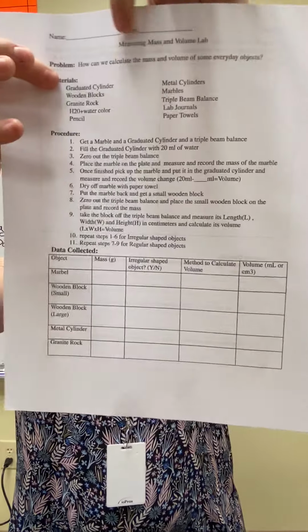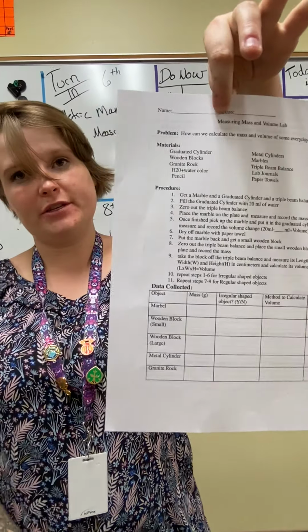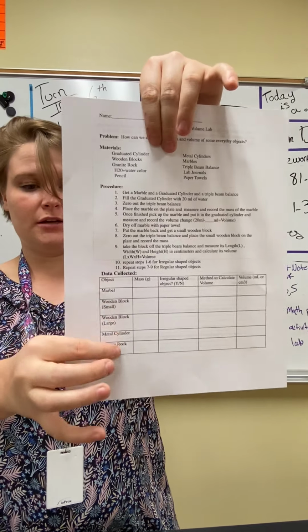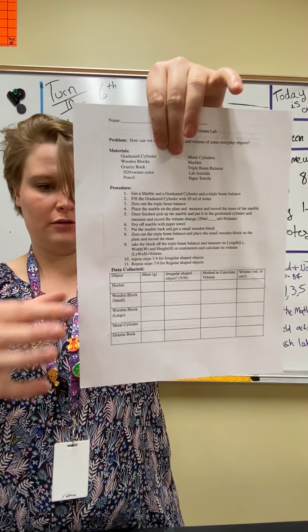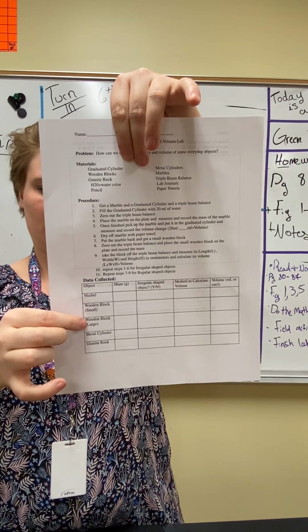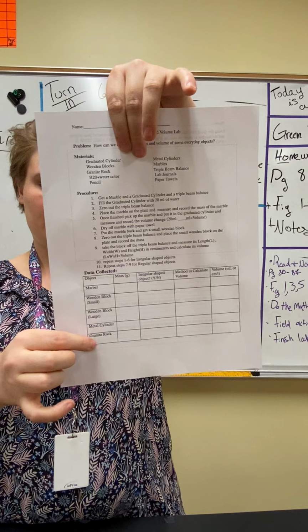All right, so if you have a printer, go ahead and print this worksheet out. If you do not, just grab a separate sheet of paper and copy the data table that I am currently pointing out to you. We're going to measure a marble, a wooden block, a small wooden block, a large wooden block, a metal cylinder, and a granite rock.